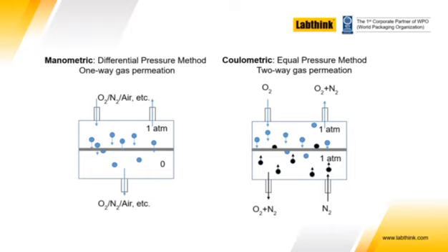And the extent of that interference depends upon the specimen and the gas that's being used. And it's not clear exactly to what extent that interference can influence the result, although I have some data which is not included in the presentation today, which shows that there is a result depending on the gases concerned.